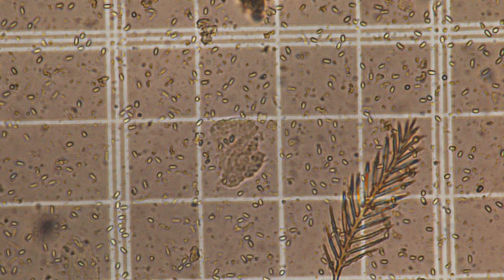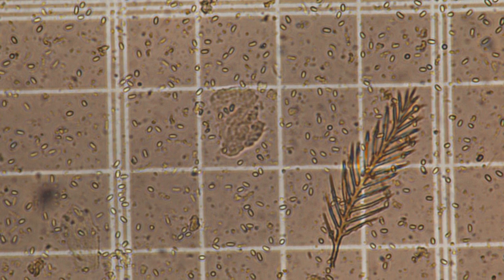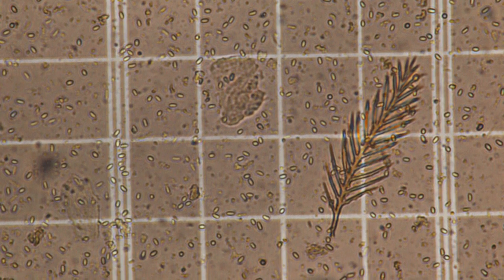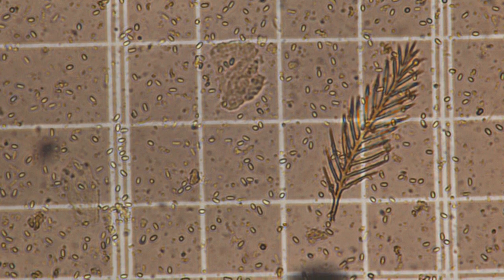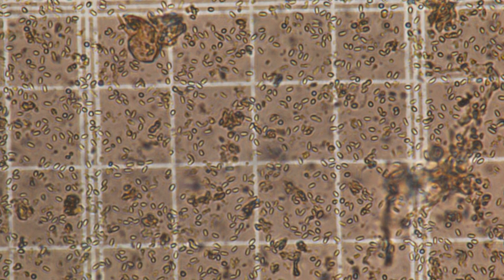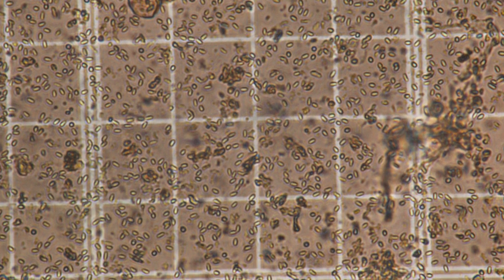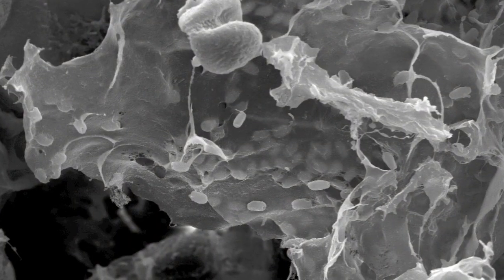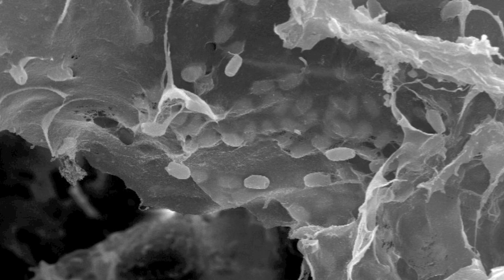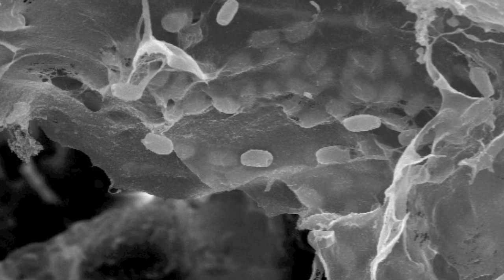These are some spores laid out on the hemocytometer grid. This is a highly infested sample — we don't want to see these, but those are spores sticking to the grid. This is another sample that's highly infested; you can see the spores very apparent there in an oval shape. This shot was taken with an electron microscope, and you can see the Nosema spores — those oval shapes — stuck to a piece of debris within a bee.